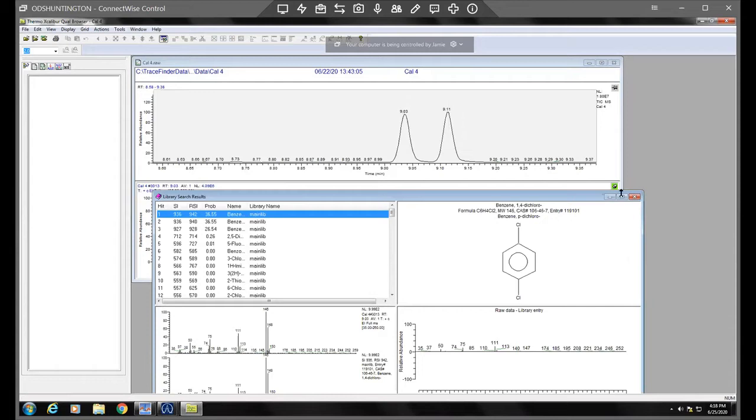So then I would, if you're doing a calibration integration and updating retention times, then I would just write that down.